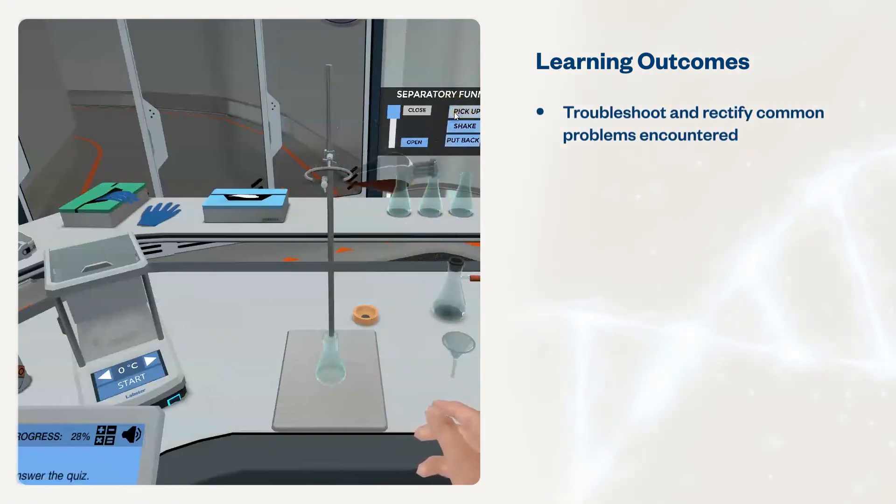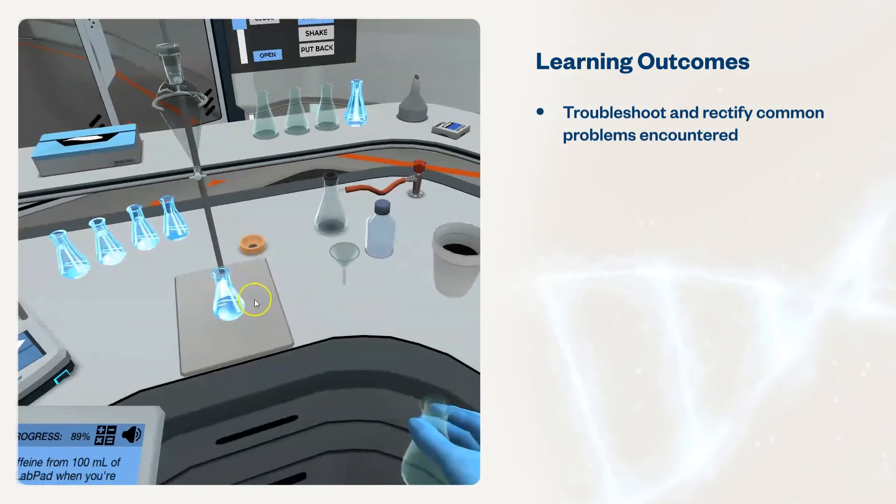Troubleshoot and rectify common problems encountered in solvent extraction protocol and rotary evaporation.